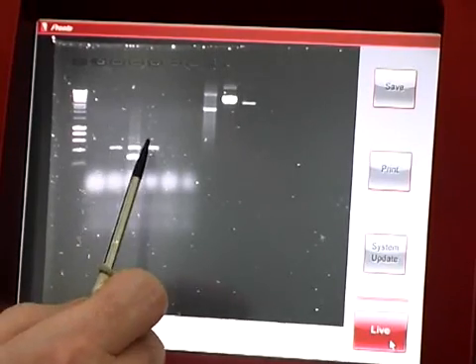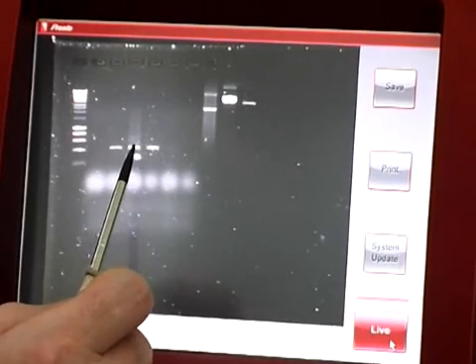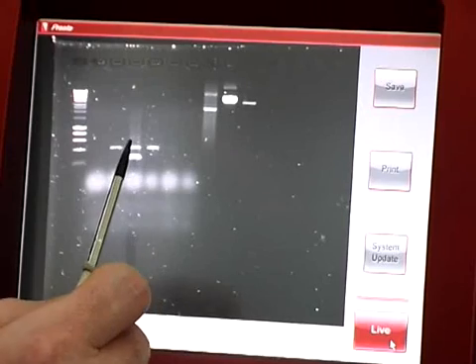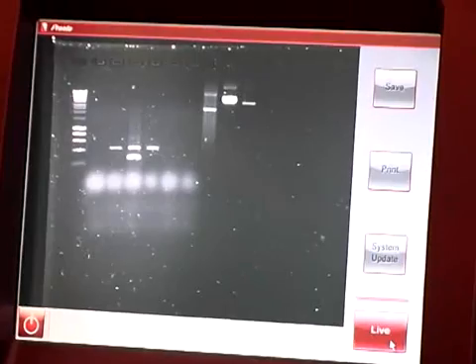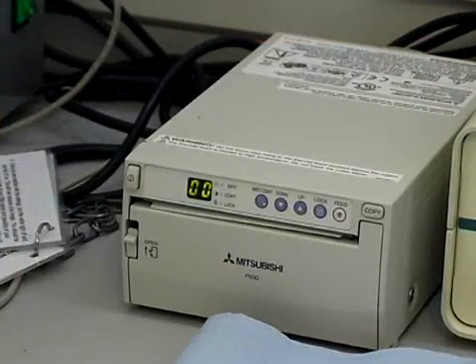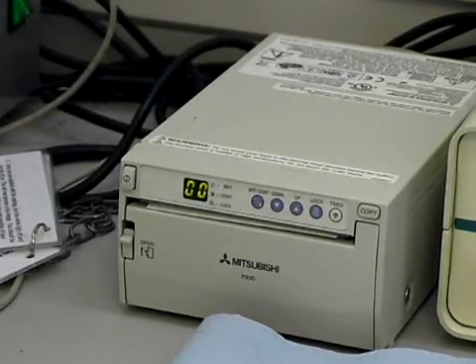That would suggest these two are homozygous whereas this one is heterozygous, so it has one gene which is this size and another piece of DNA which is this size. Once we have visualized the gel we can print a picture of it and keep that as a permanent record of our analysis.